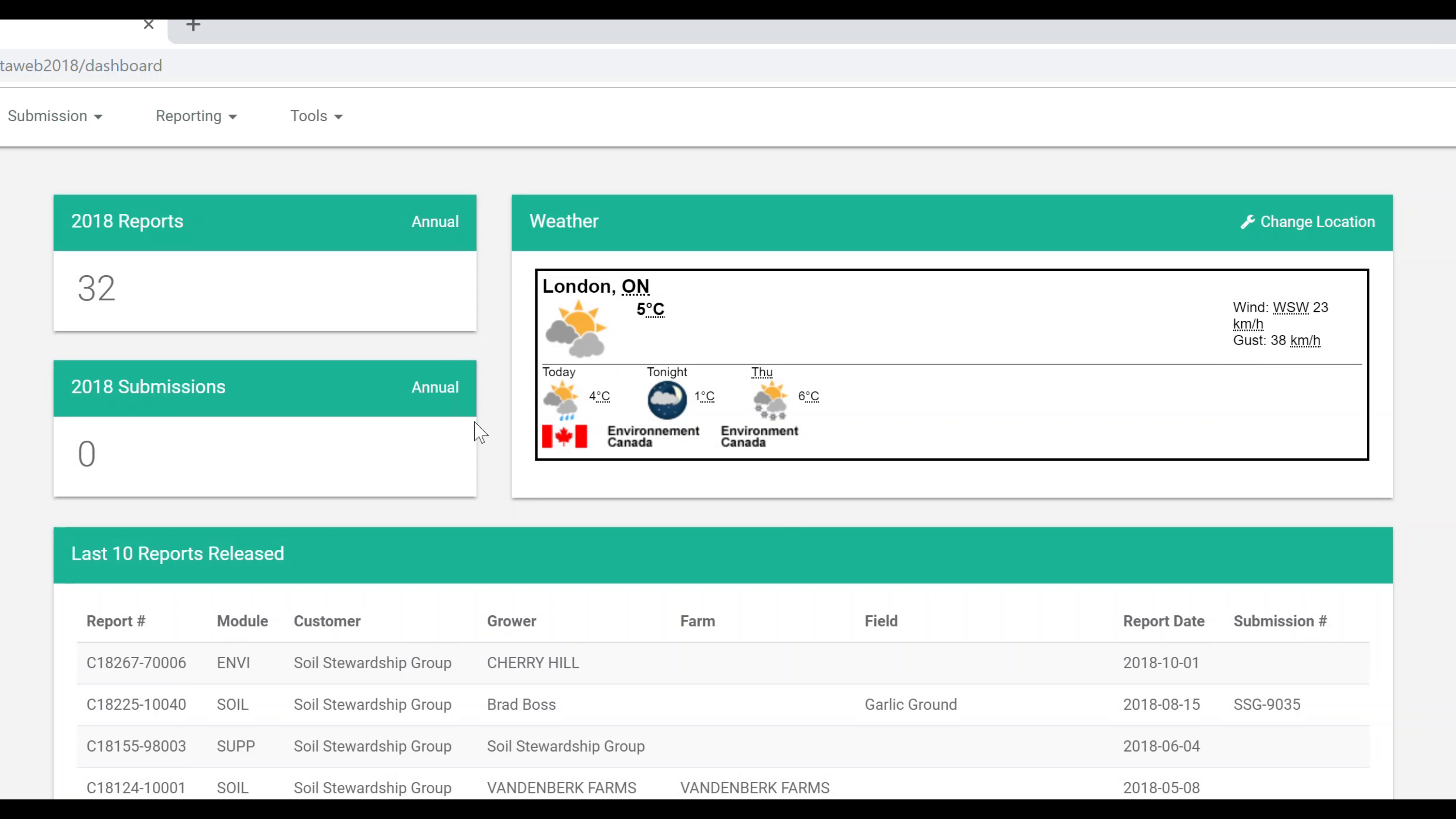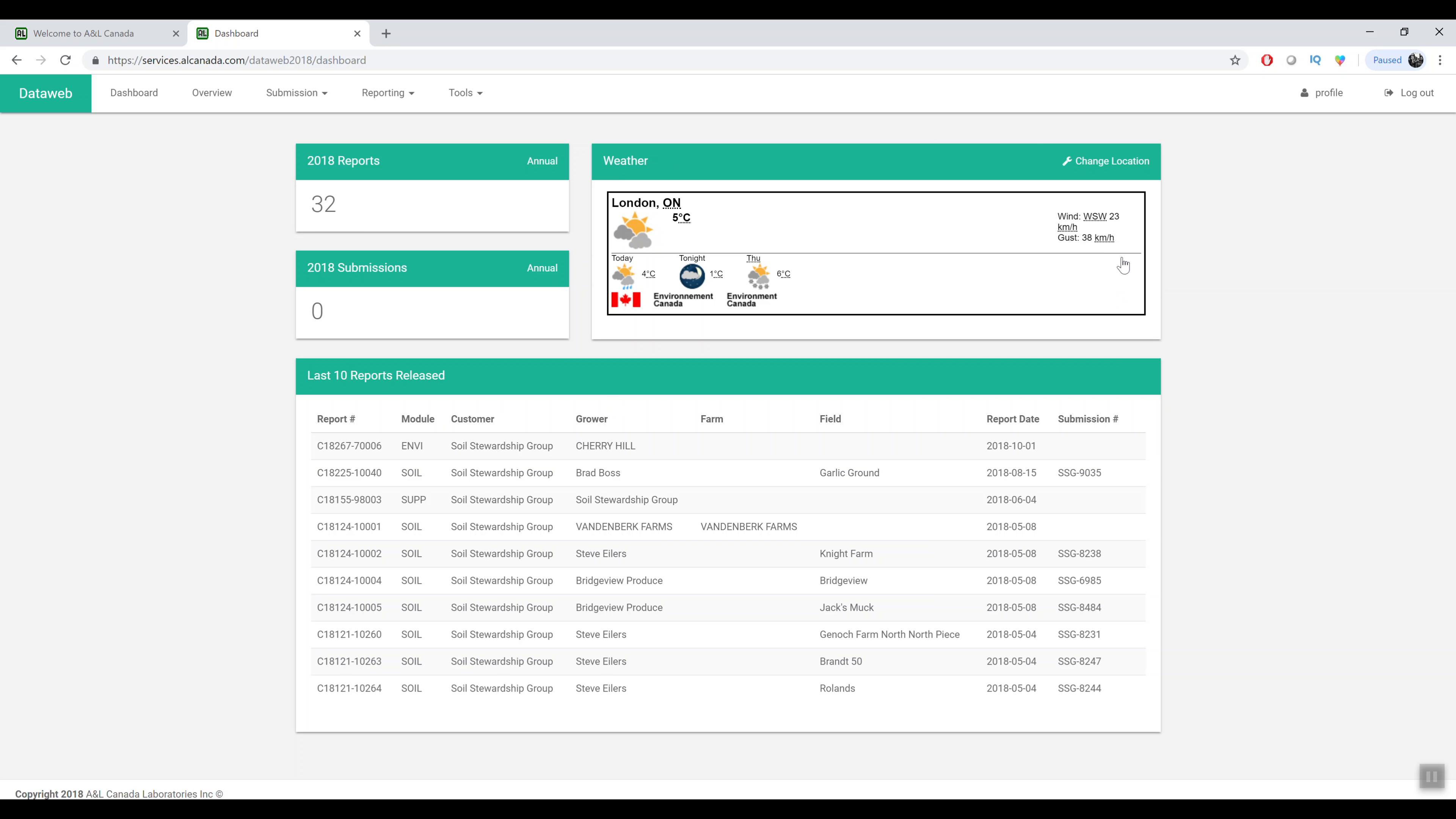When you log in you'll be brought to a dashboard screen. This screen just has a few snippets of information, your number of reports, number of submissions. We have a local weather app here. We'll be adding more features to this dashboard screen in the future so stay tuned for those.